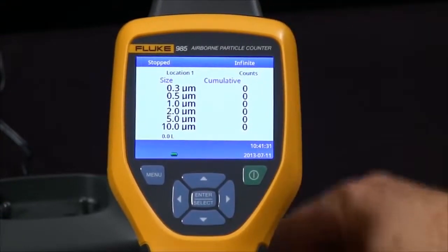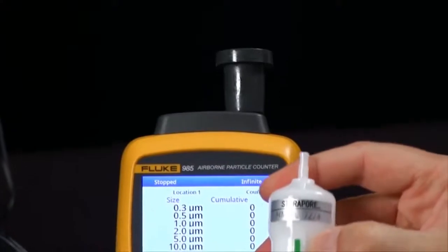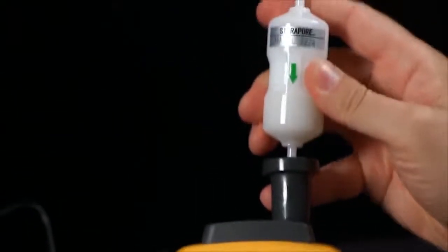To establish a baseline we provide an adapter which goes over the sample port and a zero pass filter. You will see the direction of airflow is indicated by the green arrow. Simply insert this into the adapter.